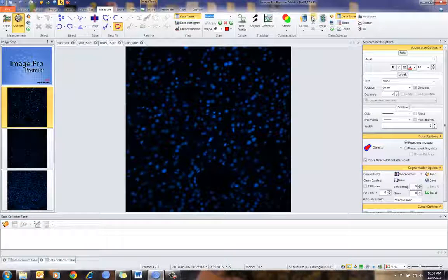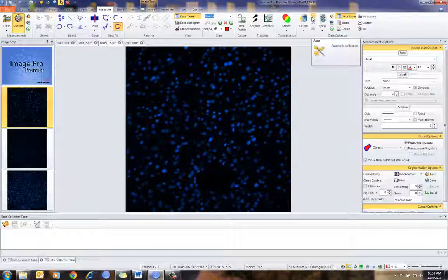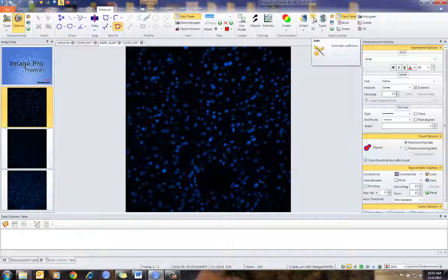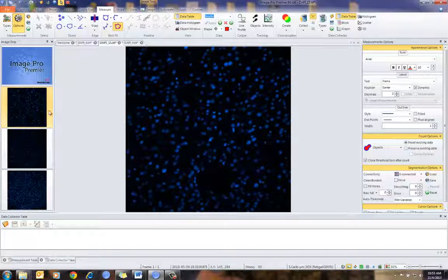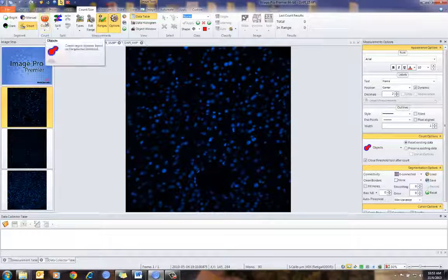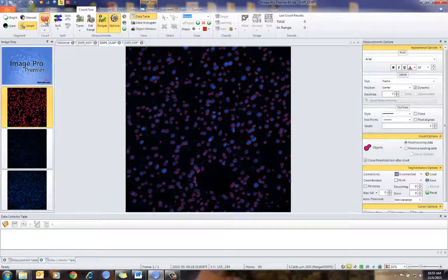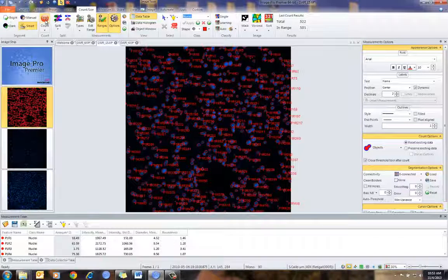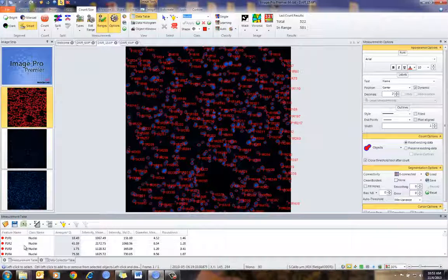Now I can turn on my automatic collection. What this will do is every time I count an image, it will automatically bring the data into Data Collector. I'm going to turn that on and go to my first image — selecting it through the image strip. In Count Size, I am going to count. And as you'll notice, automatically, Data Collector is populated with the data from that image.